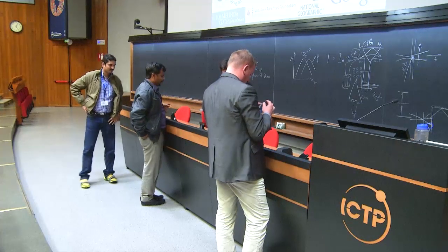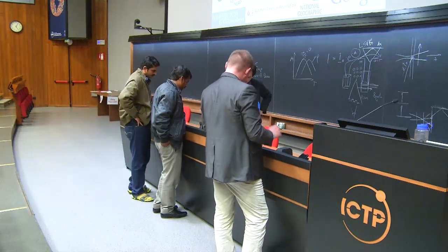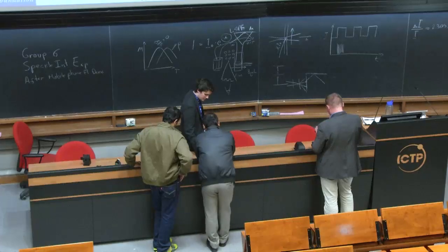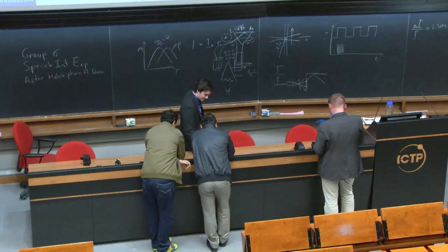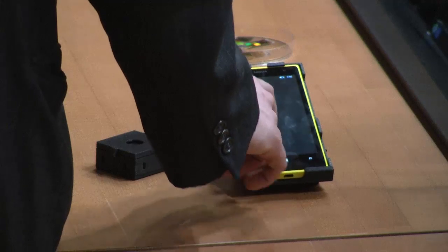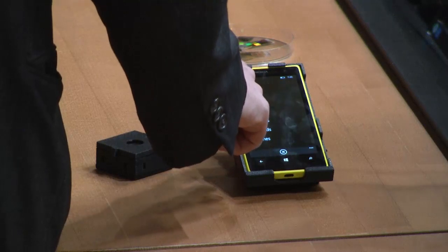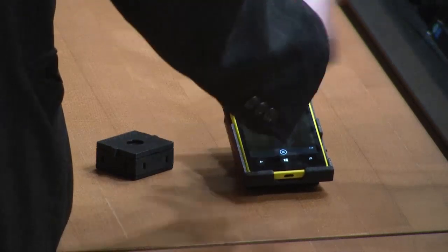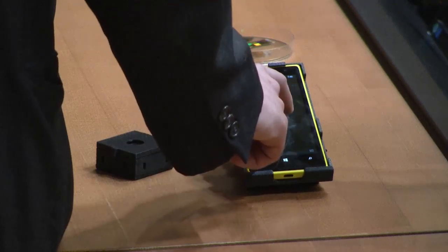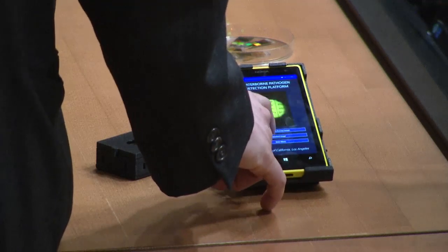Yep, we have one whole lab dedicated to this. So this is the Giardia app. Now I haven't taken any images of Giardia samples with this phone, so I have to find the image in the camera roll that I've uploaded. But this one is an example of a Giardia cyst. It doesn't matter what the preview image is, so I'm going to upload this.